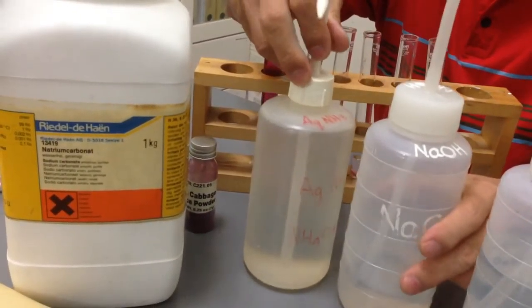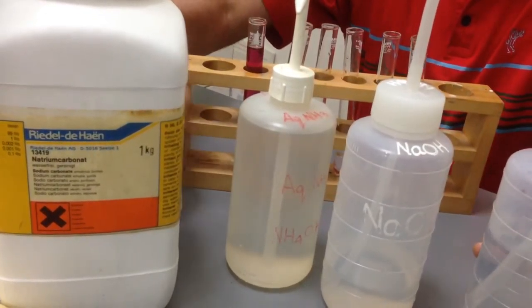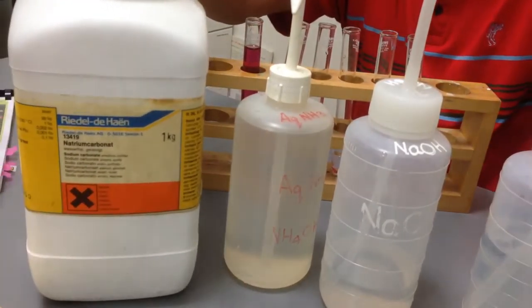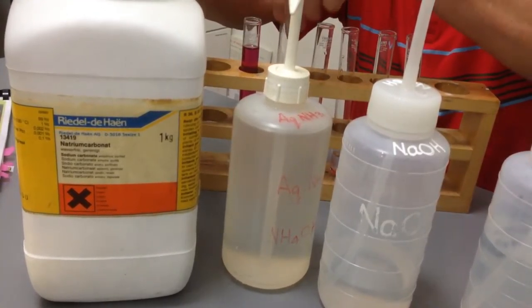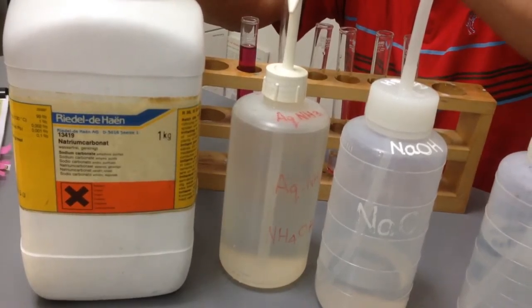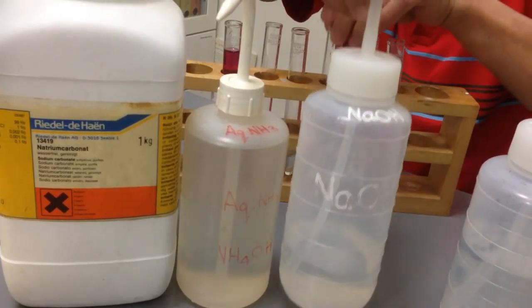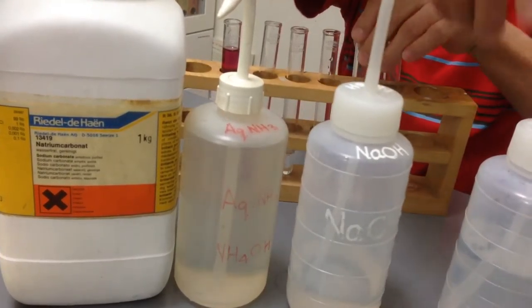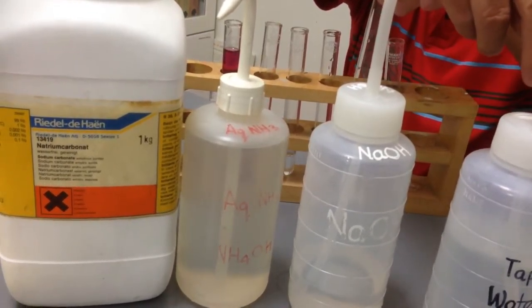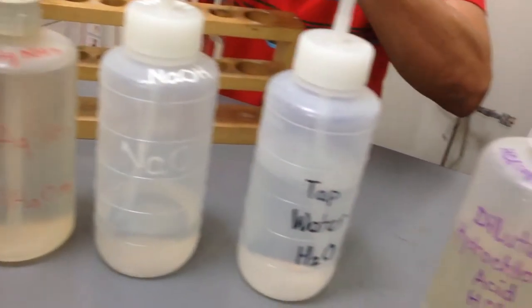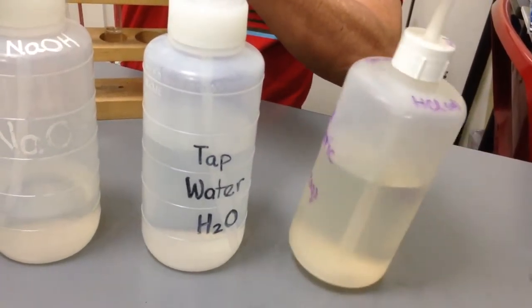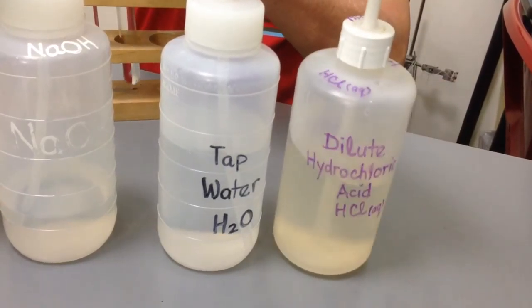Let me go through the five test tubes again. The first test tube here is sodium carbonate solution. The second test tube is aqueous ammonia. Third is sodium hydroxide. Fourth is just tap water. And fifth is hydrochloric acid, dilute hydrochloric acid.